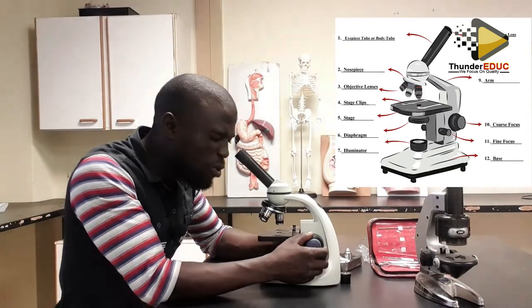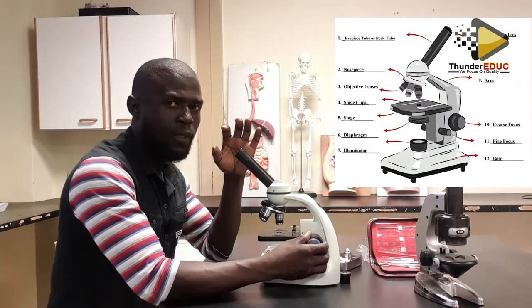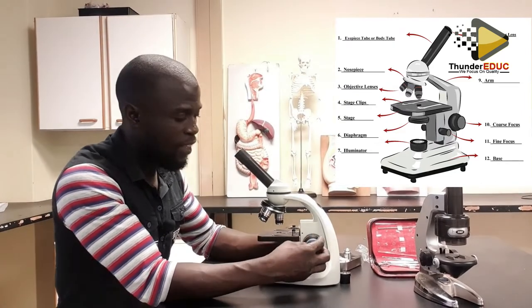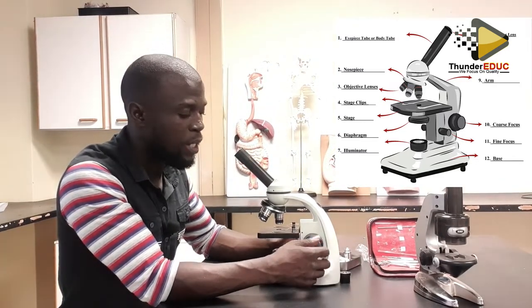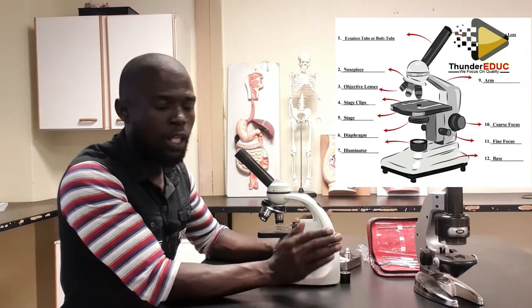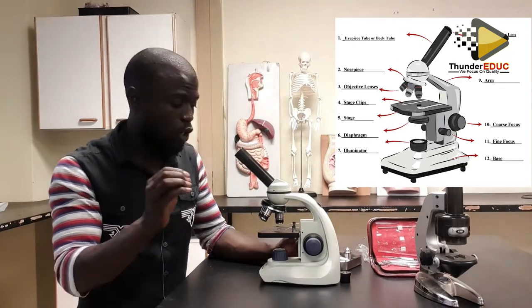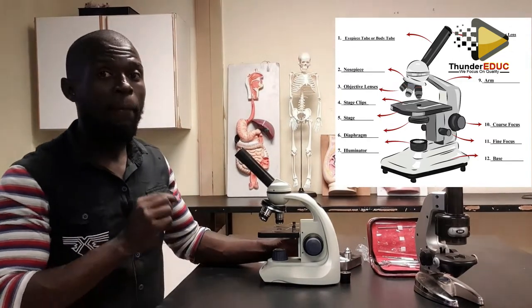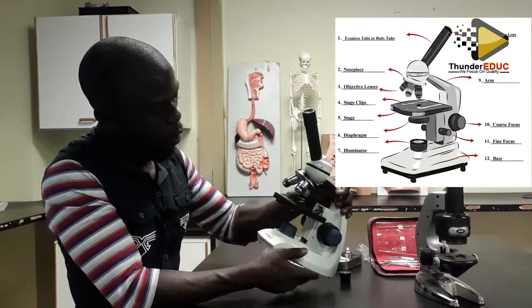Now, when you are turning like this, you see the object a bit, but it's not yet clear. Then you stop, and you turn using the fine adjustment knob. This fine adjustment knob is a little bit slow, so you can focus the object clearly. That's why it's called the fine adjustment knob, so that it brings the fine focus of the object when you are trying to view it under a microscope.